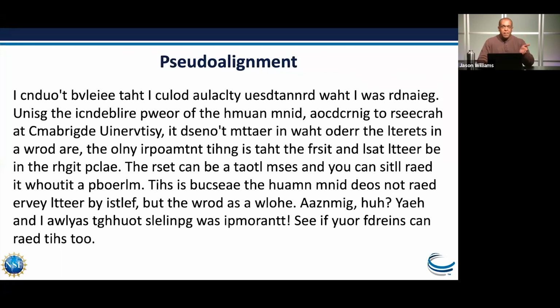And oftentimes when we're looking at a transcript, just looking at the first k-mer and the last k-mer is enough to determine whether that read came from one transcript or another. Read the paper, listen to this again, think about it, but essentially what that does is reduce the amount of computation. You're not matching nucleotide by nucleotide, but you're throwing away a lot of information that you don't need in order to just get an idea of whether this count can be called for one transcript or another.